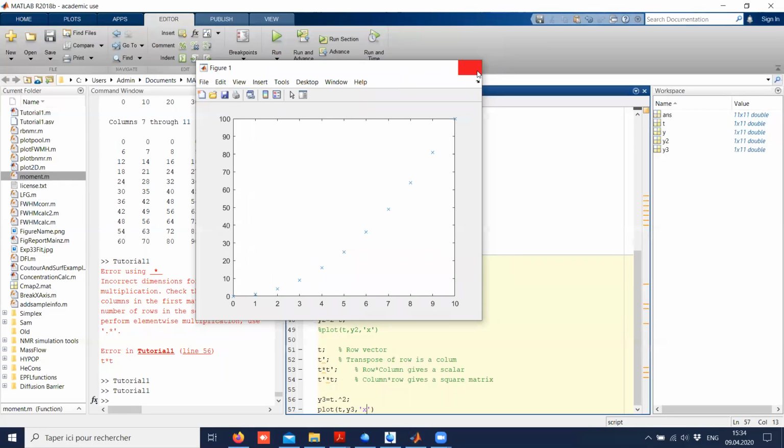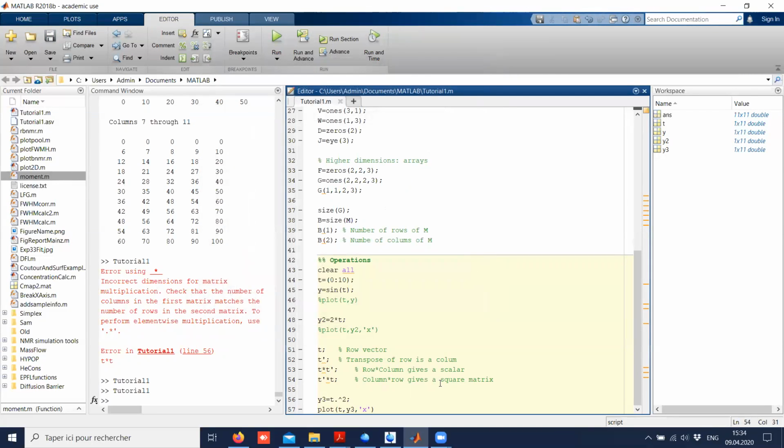I have a question. Maybe you're going to come on to this, but I'll ask you before I forget. Here you create a list of time points, and that feeds into a function, and you can plot the result of the function against the time points. So this is the equivalent of list plot in Mathematica. Mathematica also has plots where you can plot functions continuously. Does Matlab have such a possibility?